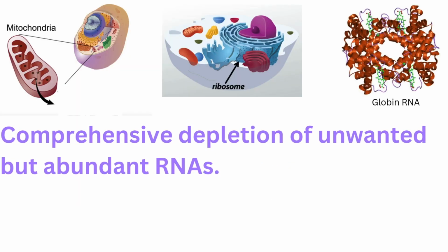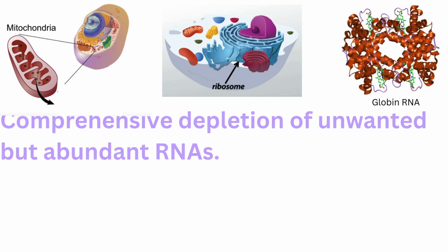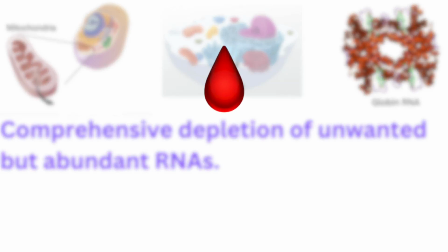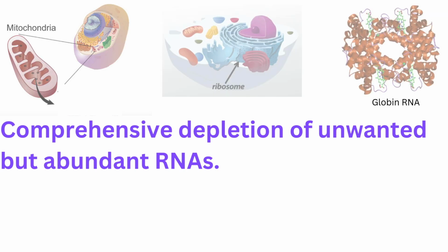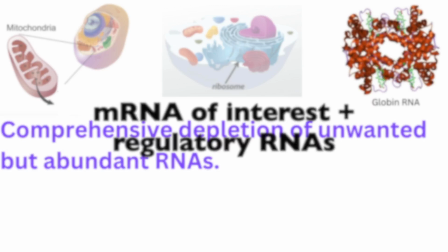So in instances where you had your ribosomal RNAs or other RNAs that you're not trying to study, for instance, if you want to get rid of messenger RNAs that are related to blood, if the cells came from a cell culture where you've used blood in the process, or you may want to get rid of ribosomal RNA that's related to mitochondria because you're not studying that. In that case, you can just target those ribosomal RNA and other RNA pieces that you're not interested in.